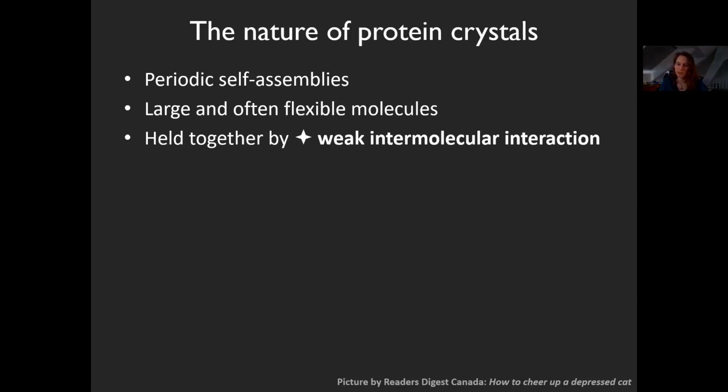Most of them are approximately as soft as butter, which makes our life quite difficult when we try to move them, for example, on a slide, because you have an acupuncture needle or a tool and you try to shift your crystal, but it's sticking to the glass slide on which you crystallized it, and then it can break, or you can just smush it. So it looks still somewhat fine, but when you put it on a diffractometer, it doesn't diffract because its order was sustained by such weak force that, well, it was just squished.